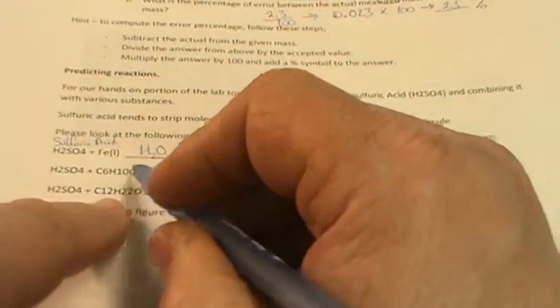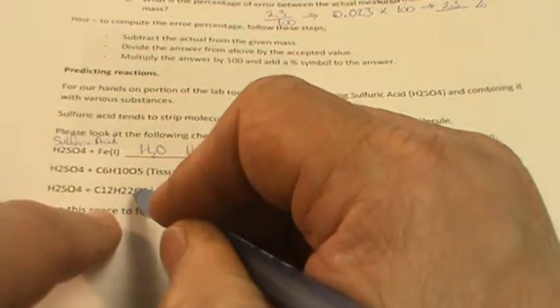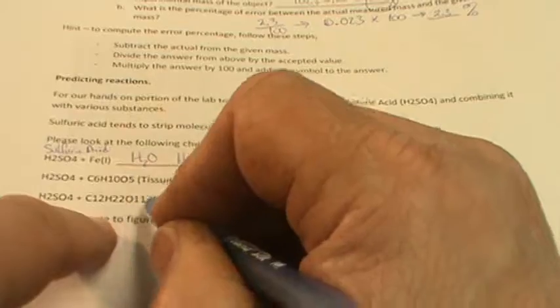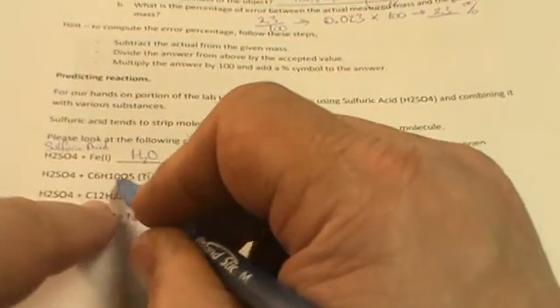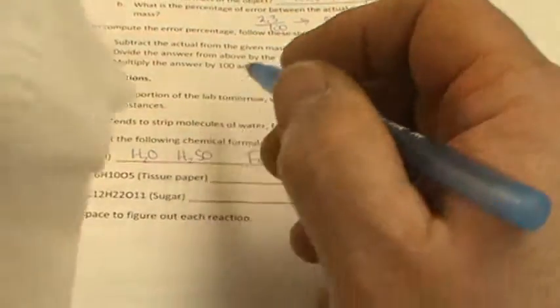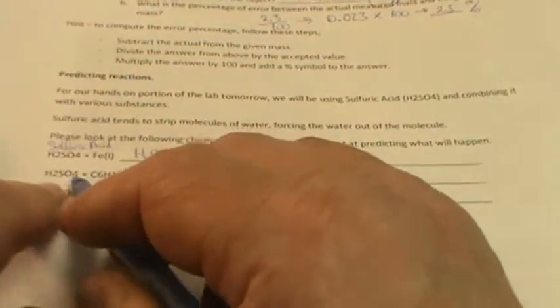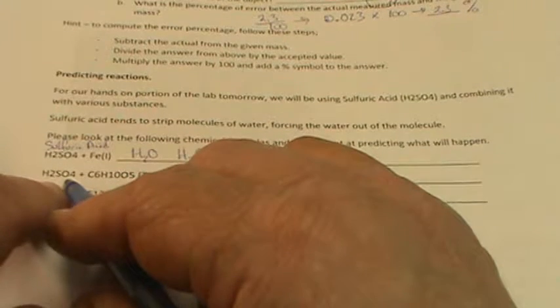Oh, look at this chemical formula. There's carbon, hydrogen, oxygen. Tissue paper and sugar are made out of the same three things, there are just not that many of them in the tissue paper. As you can see, tissue paper looks like sugar, it's white, but it sure doesn't taste like sugar. It's not very sweet at all. But what happens now? Here's the thing with sulfuric acid.